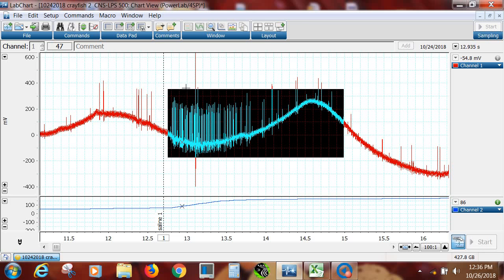So now we want to count over a certain period of time. Let's say it takes us really about 2 seconds to make the brushing on the side of the cuticle, because we brush down one way with the manipulator and then we brush back to the starting spot. So it's like 1/1000, 2/1000. So if we are consistent in our analysis, then let's try a 2-second analysis.